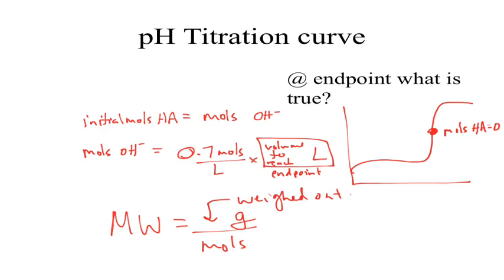The more points you can get on that line, the more accurate your results will be, the more points you get on the lab report. Your lab notebook procedure thing provides 3 methods for determining that endpoint value. I do expect you to do at least one of those methods. We'll talk about that on Thursday again once we have data. So at that point, I'm done talking, unless you guys have questions.